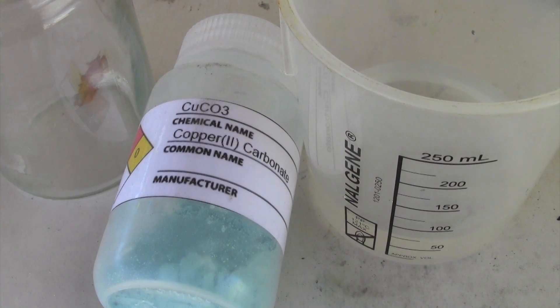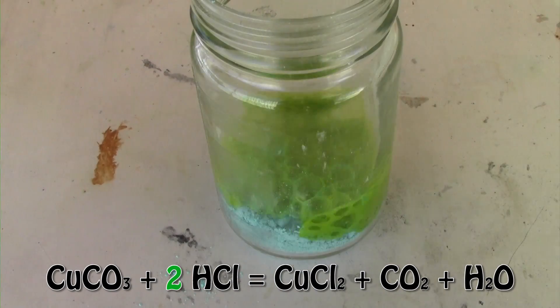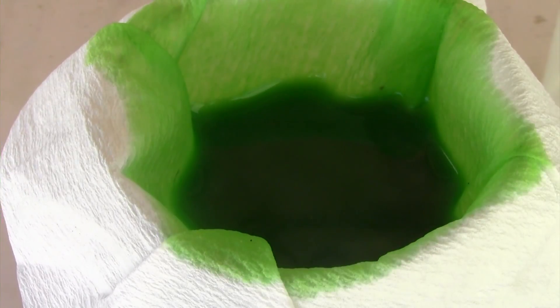The first method will be using copper carbonate, which I made in a previous video but can easily be bought online, along with hydrochloric acid. Remember we are working with acids so gloves are a must. Simply add the copper carbonate into the beaker and add hydrochloric acid until it stops bubbling. You can filter it off if you want, or you can just let it evaporate once the solution has finished reacting.